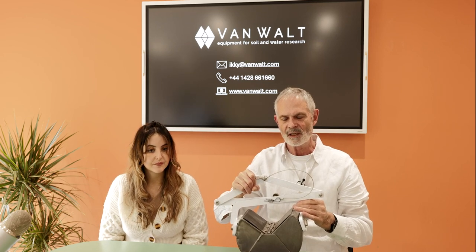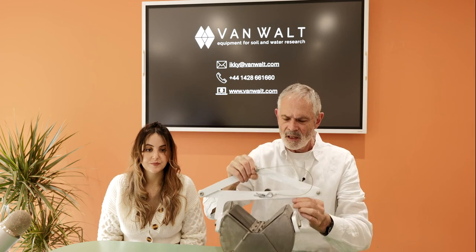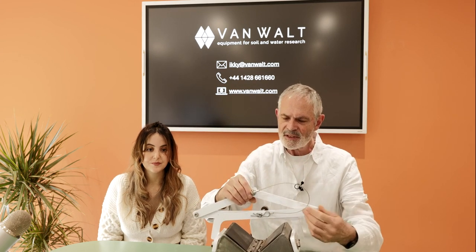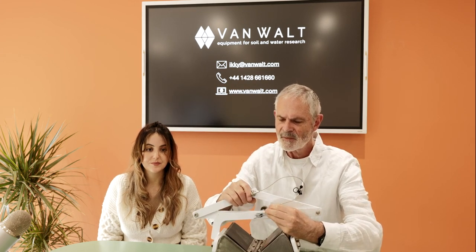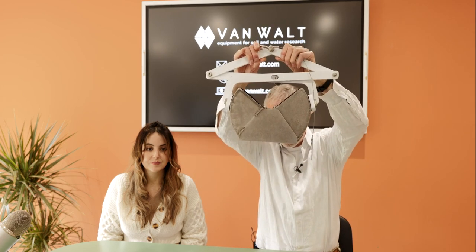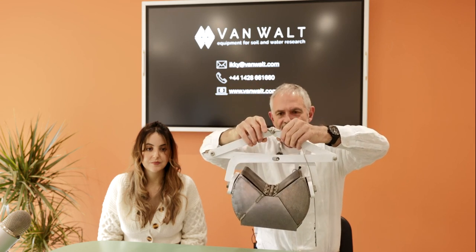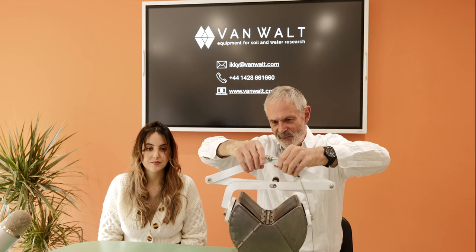So lowered to the base of your pond or river or lake. What happens with this tool is that it's deployed in an open position, and it's lowered on a string, on a rope, down to the lake bed.